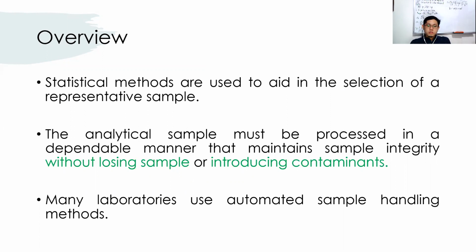results. So, many laboratories use automated sample handling methods. So, the best example here is your HPLC.